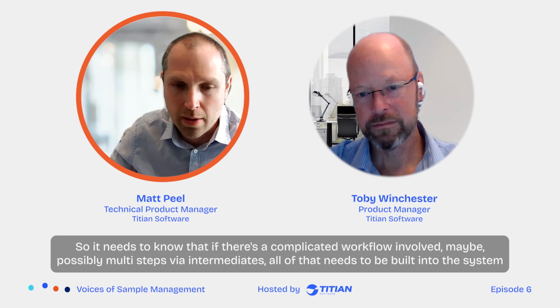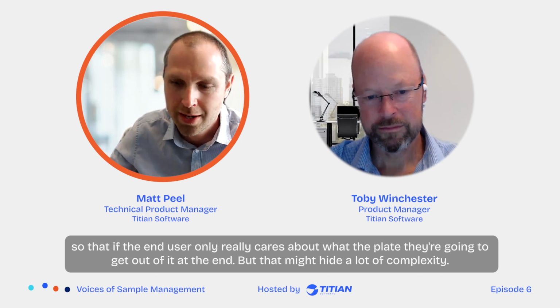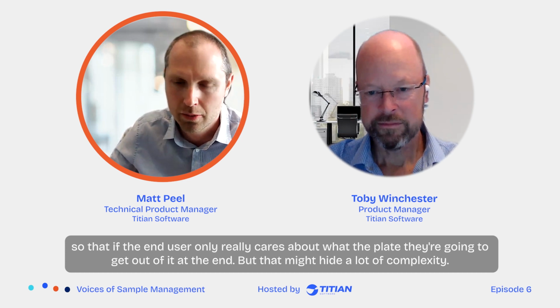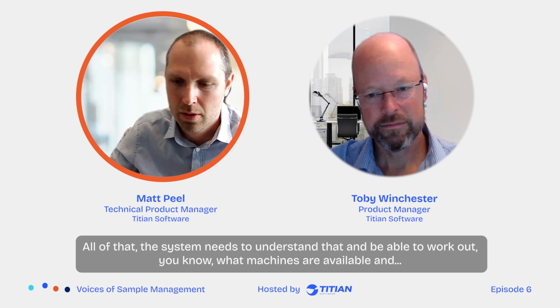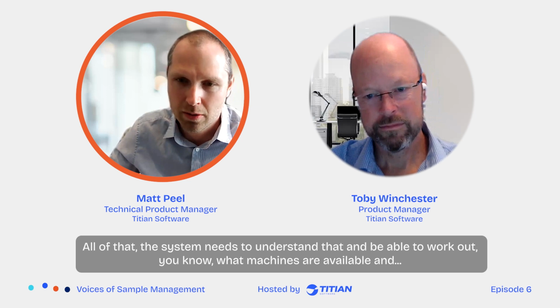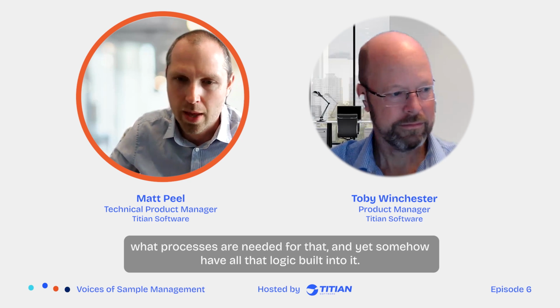So obviously it needs to know that if there's a complicated workflow involved, possibly multi-step via intermediates, all of that needs to be built into the system, so that if the end user only really cares about the plate they're going to get at the end, which might hide a lot of complexity. Different machines need to be used, different types of labware involved. The system needs to understand all of that and be able to work out what machines are available and what processes are needed, to have all that logic built into it.